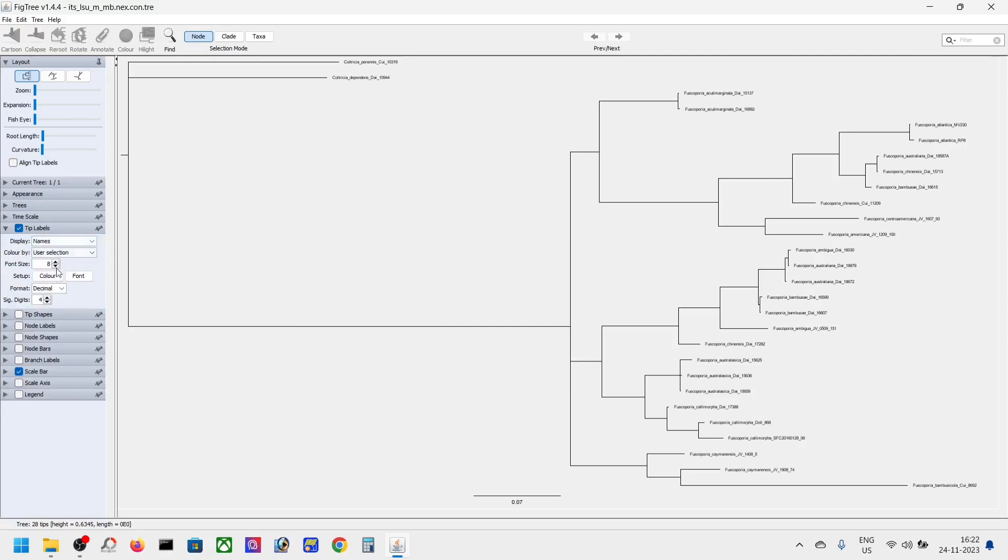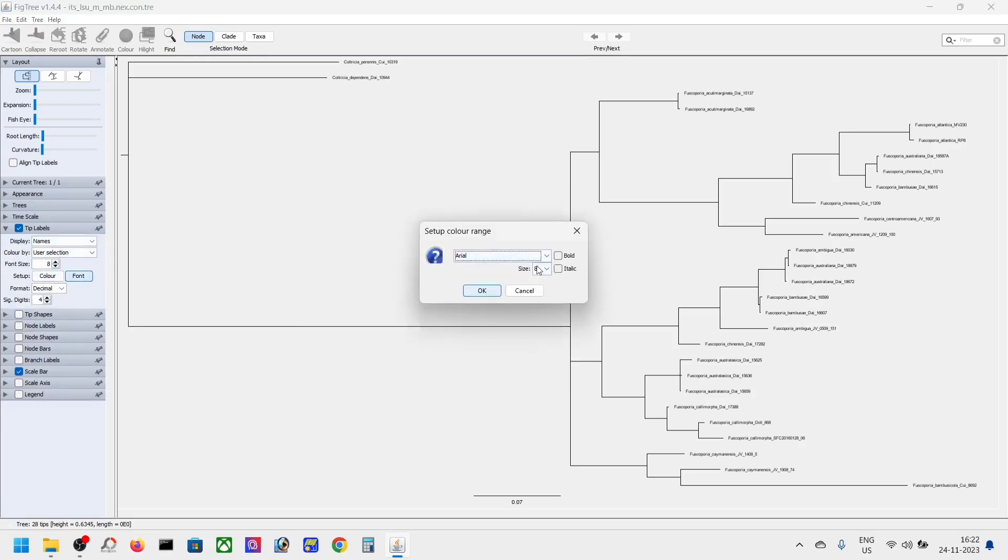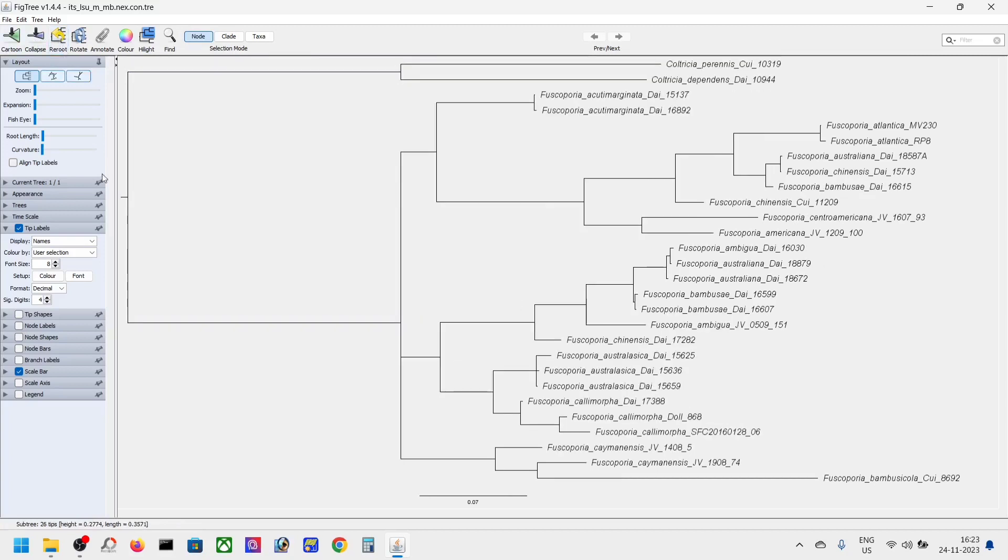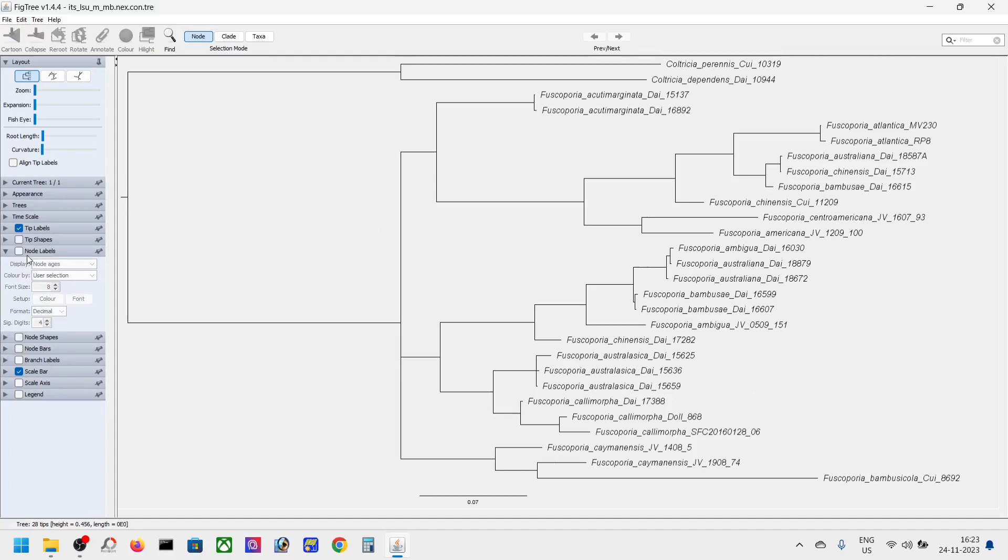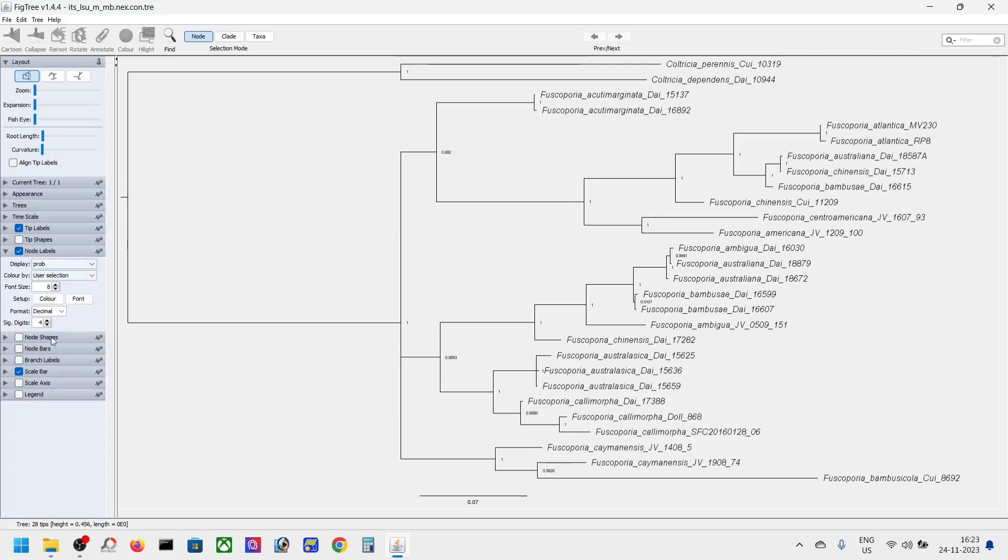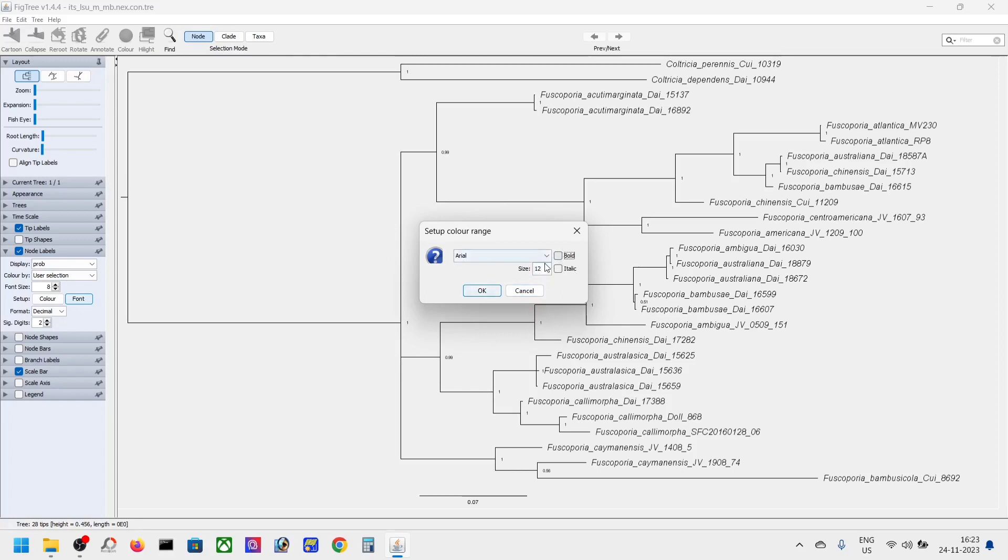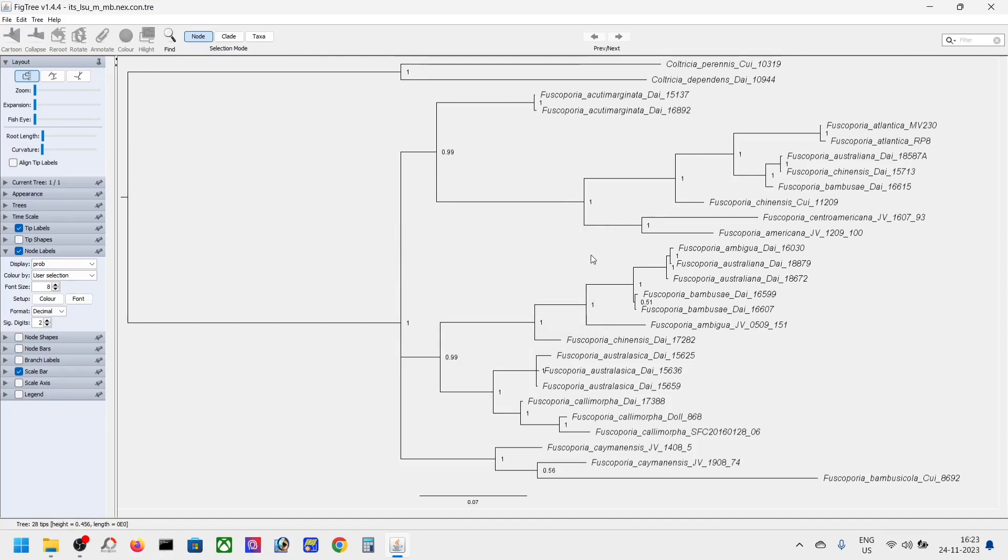You can increase the size of the letters. You can see this is the outgroup—select root here. The values shown are the Bayesian posterior probability values, which is the actual value we're looking for. You can keep it after two decimal places. This is the Bayesian posterior probability tree.